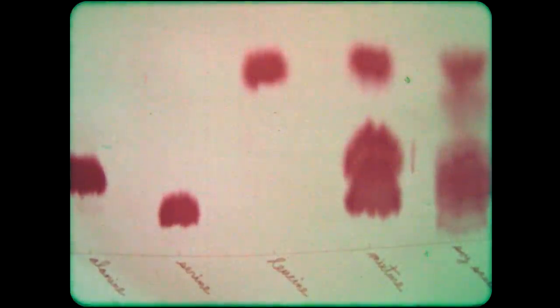On the far right is the chromatographic separation of a spot of soybean sauce made from the highly proteinaceous soybean. The two amino acids circled are probably alanine and leucine because of their position on the chromatogram.